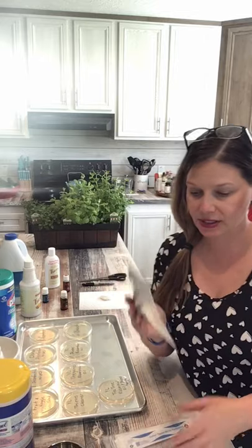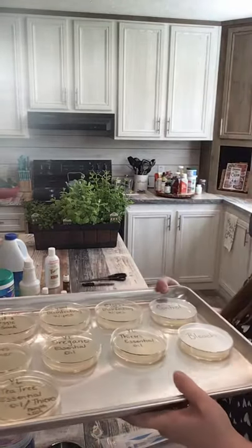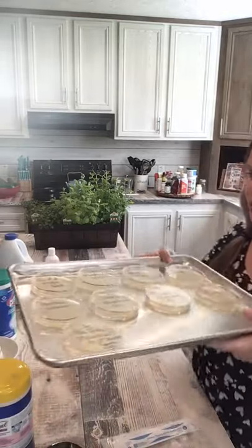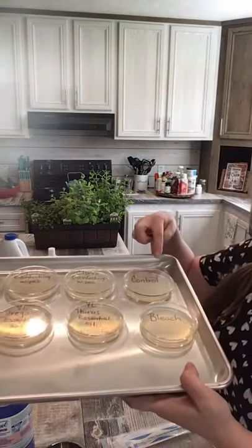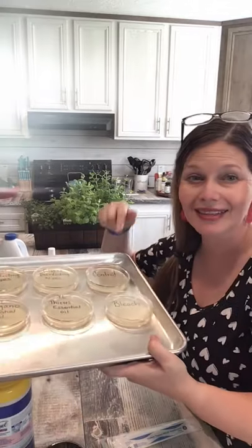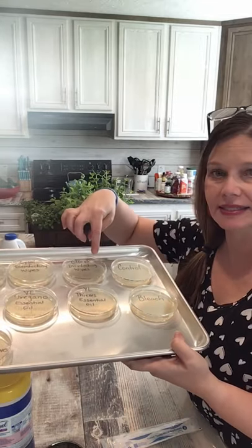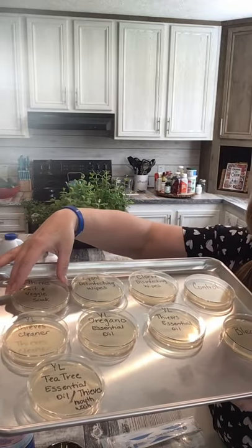What I've already done — let me just show you real quick — there's nothing in here except the agar that's already in the petri dishes. All I did was place them in a pan and label them. For this experiment I chose just a few items. You always have to have a control group, which means nothing is going to go in here — no cleaners whatsoever will go in the control group.